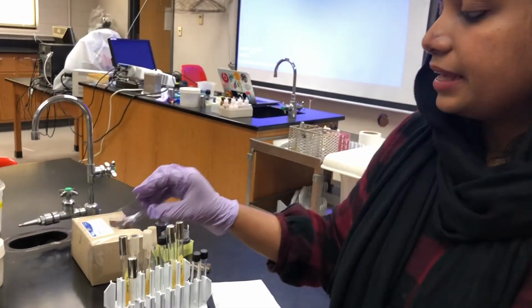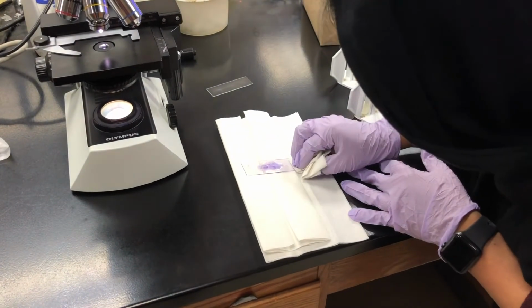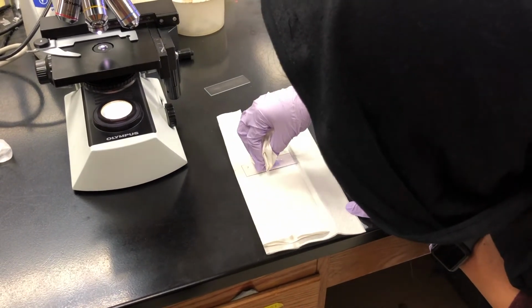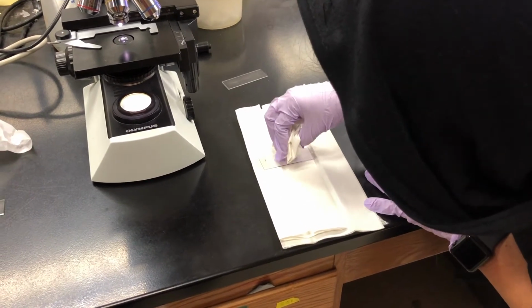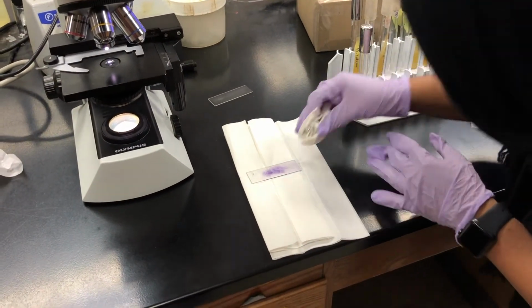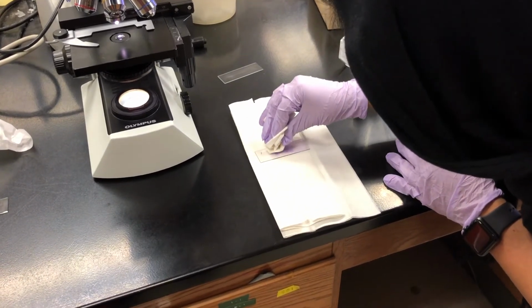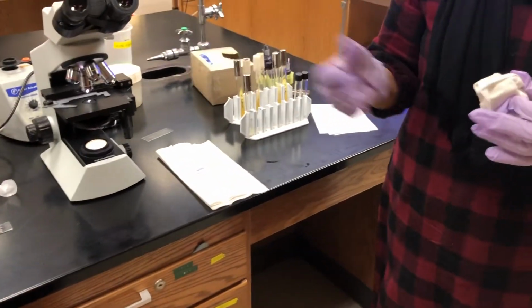So after rinsing, I'm keeping the slide on a paper towel and gently blotting it dry on the sides, and then gently on the surface. Okay, don't put too much pressure on the center though. And after that, I will be viewing the cells under the microscope.